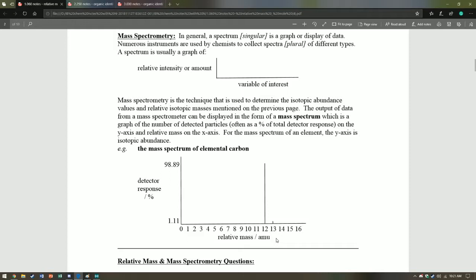From this data we can take a weighted average. We take the percent times the mass of that peak, plus the percent times the mass of the other peak, and so on, to take an average. We take the percent divided by 100 and multiply it by the mass that we record at that peak, and take the sum of each of those.